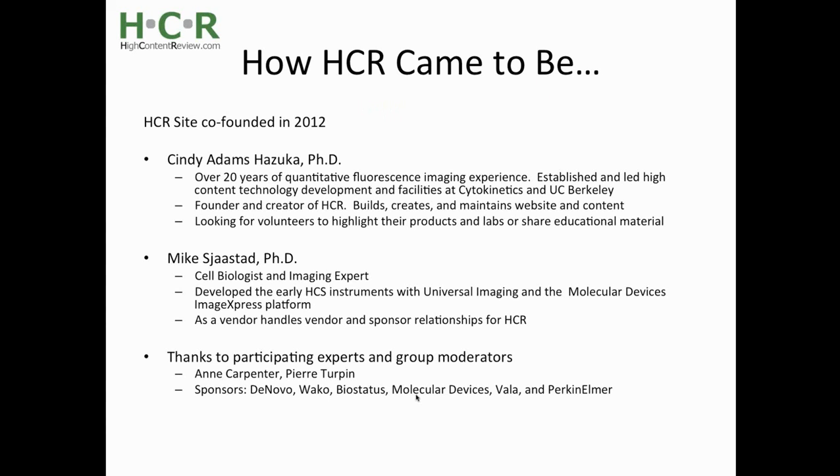A majority of Mike's experience has been on the vendor side, where, for example, he's helped develop and market Molecular Devices' ImageXpress platform, whereas I've been really a high-content super user, developing experiments from conception to analysis and working with vendors and in-house staff to customize processes and build equipment and software.